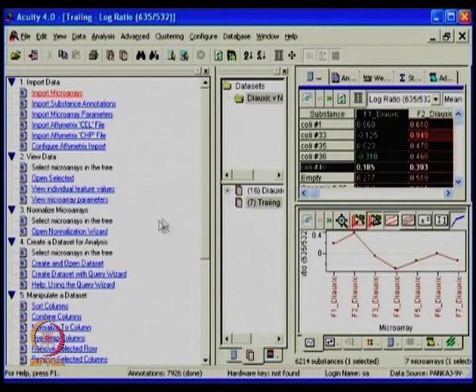I need to make sure that all my chips are normalized similarly. Essentially, when I import the data, I prefer it non-normalized, and then I select one base of normalization. I can create the same experiment with different normalizations and do the further analysis from there. Once we have finished the normalization method, you can look at a query, which is creating a data set. As we described, one simple way is to right click the data, select the chips and then create a data set, or you can come here and say create a data set from the open data set.